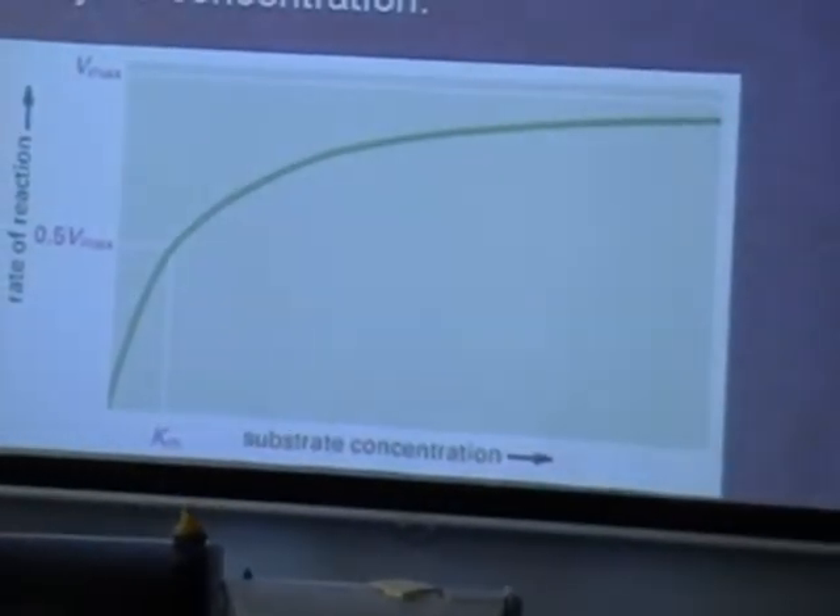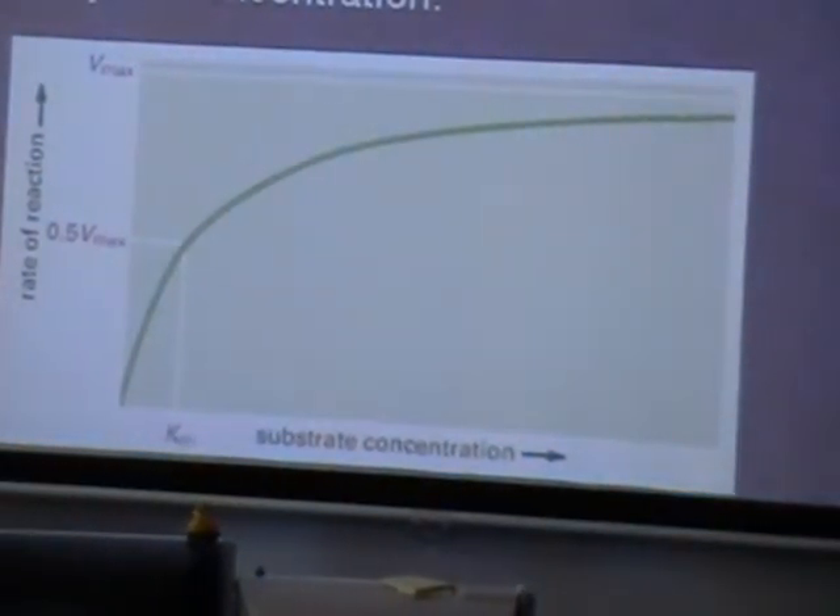Here is a graph of what was expected. As the concentration went up, the reaction rate should have gone up, giving a curve. My results, however, went the other way.